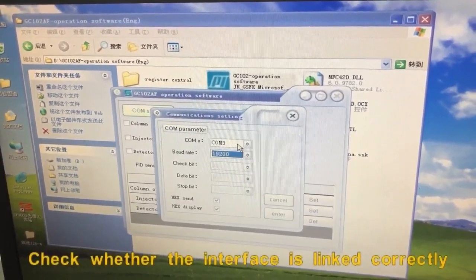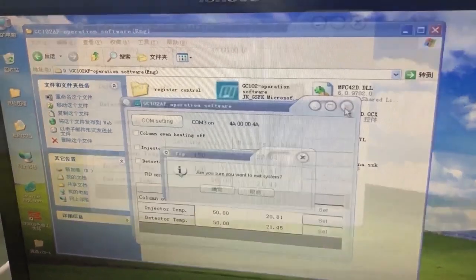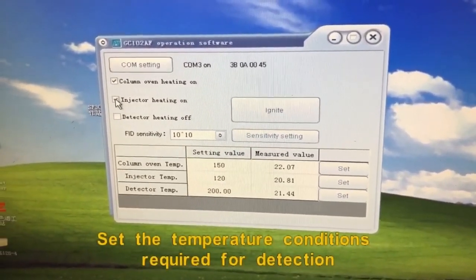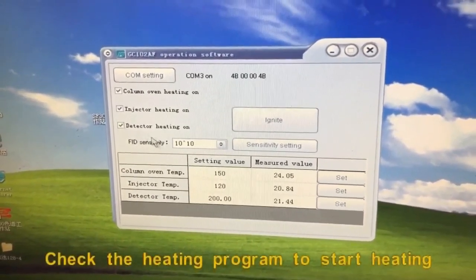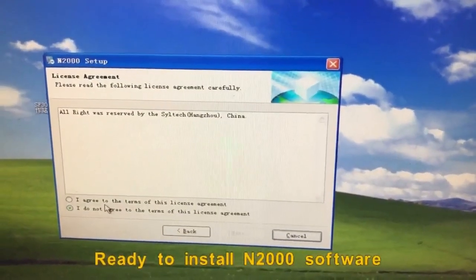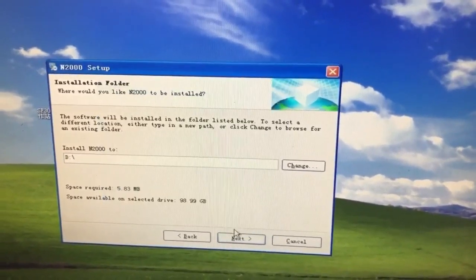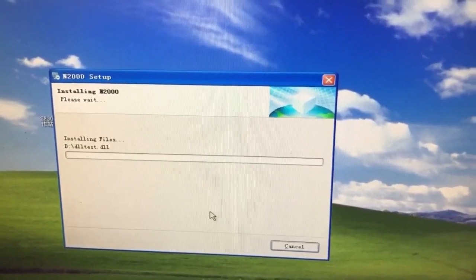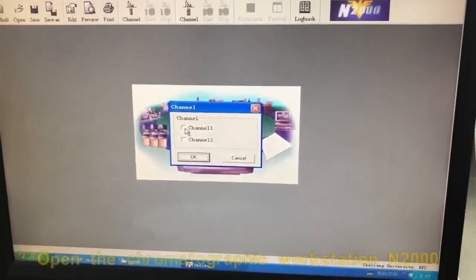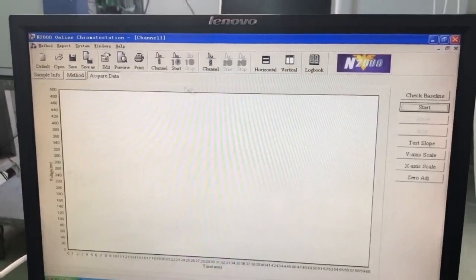Install the software and run the software. Check whether the interface is linked correctly and verify the connection. Check the heating program to start heating. Ready to install M2000 software. Open the chromatographic workstation in M2000 software.